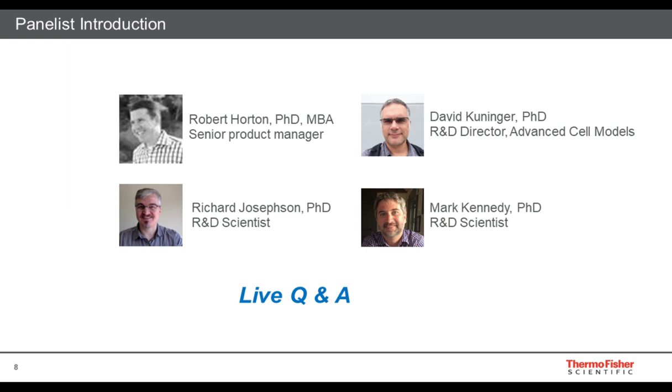And some of the published models that we've seen, at least on the face of it, seem to be more reproducible. And, depending on what research question you're asking, the level of complexity that you need is probably an important consideration as well. For that very reason, you may struggle to get enough samples that are consistent if you're working with a more complex model, but if you don't need that complex model, you may just get better data with a somewhat more simplified version of that type of organoid, something that represents a smaller region of a given tissue.